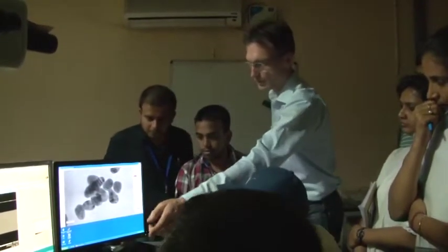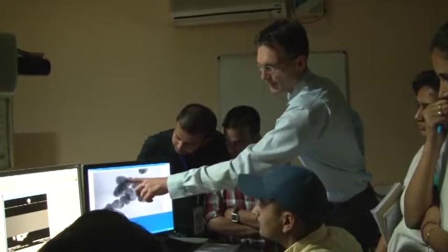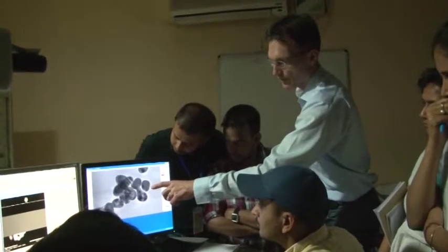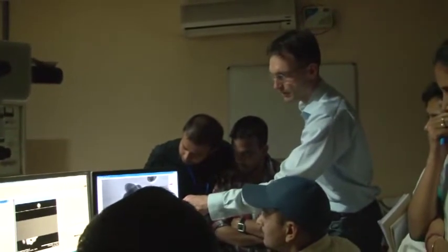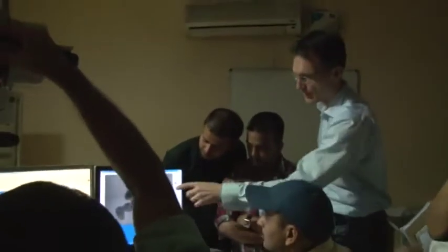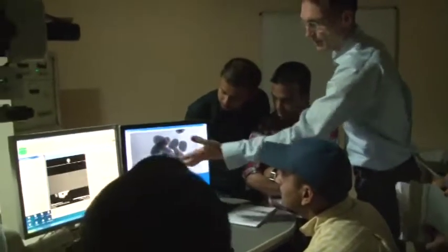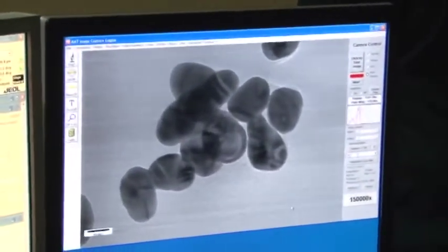If you now focus a little better, this will merge. So this is the direction of diffraction. It's somehow close to focus now, and if you insert the aperture again, it should almost fit the same position. Even with the larger one, now it's gone. It's totally gone because you block off this diffracted beam, meaning this diffracted image intensity.